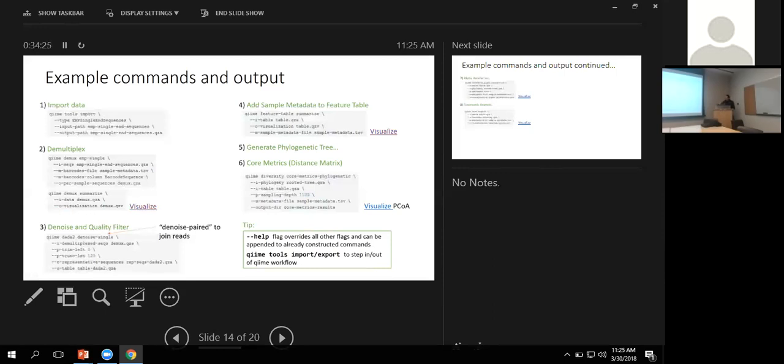And again, you get this kind of summary data on the first tab here. There are always a couple of tabs up here. You get this kind of summary data and some summary visuals as well. What's really interesting about this one, I guess it's kind of trivial, but I find it to be pretty useful. We can look at the data like this.